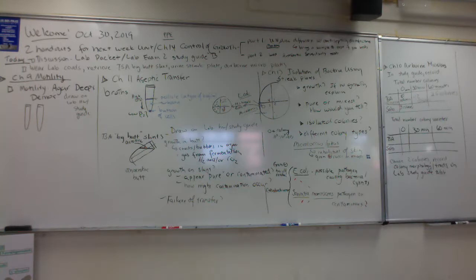This one has some circles, but they look different. So for sure you've got one, and then you've got 1, 2, 3. My guess is you've got probably a Proteus in there, and that's what's covering the whole entire plate. So count that as 1, and then the additional circles. That's so cool. That's really nice.